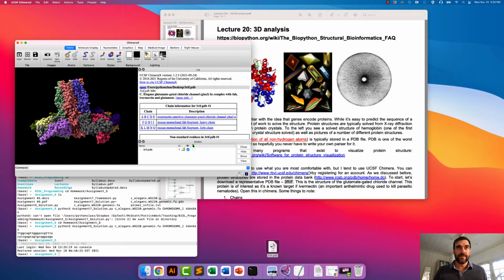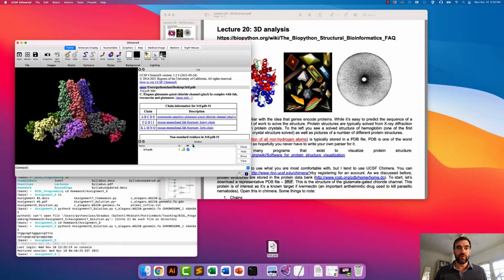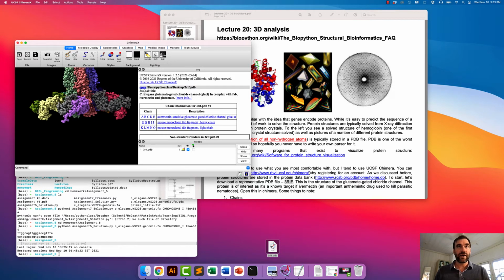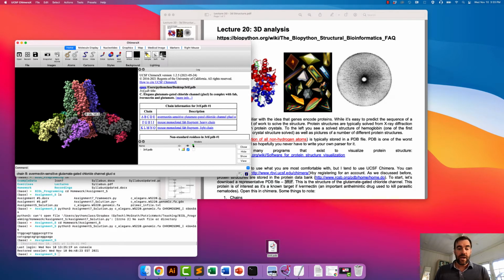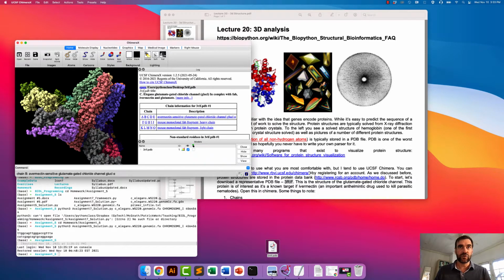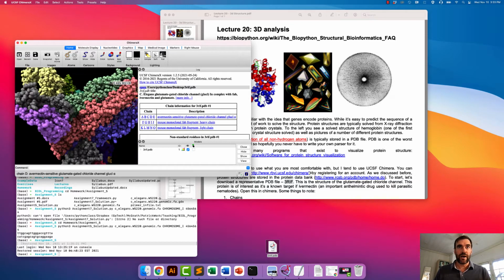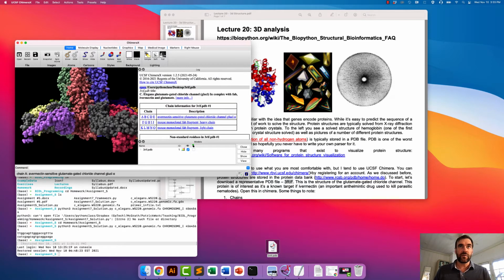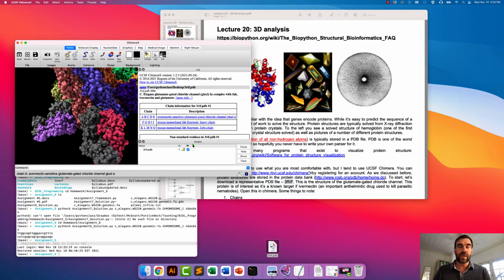And then it depends on your exact computer. So sometimes for the Macintosh, you hold Shift, and then if you hold Shift, you can translate it up and down, left, right. And then if you want to zoom in, you use the pinching opposite, and you can either zoom in or zoom out of it. So it's going to take you a little bit of a while to get used to that.